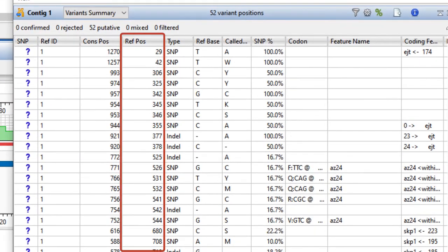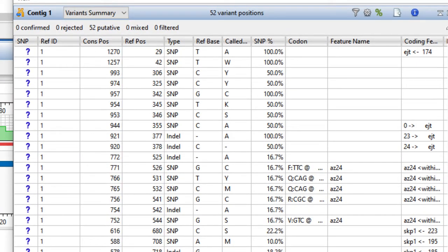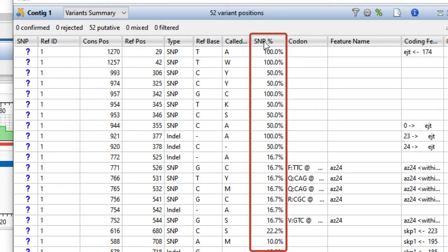This table is initially sorted according to reference position, but is fully interactive and can be sorted by any column.